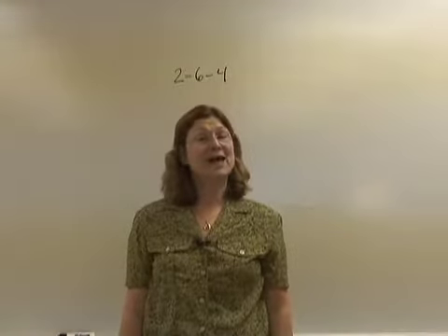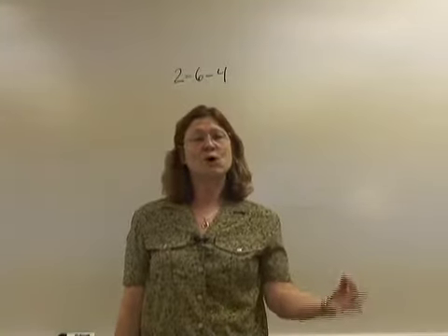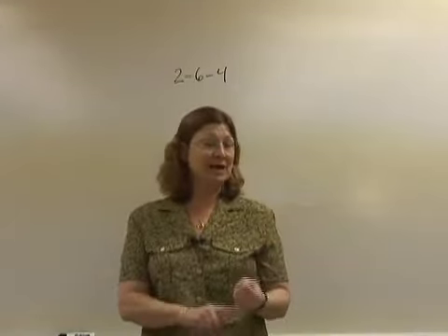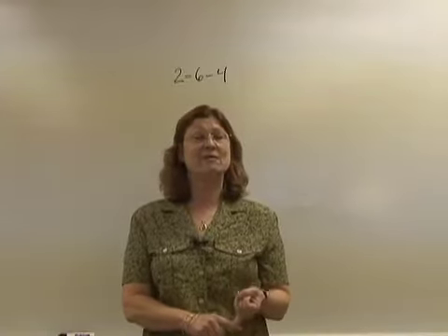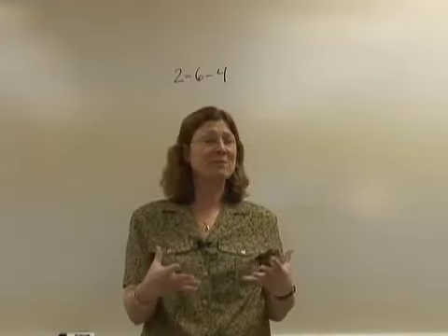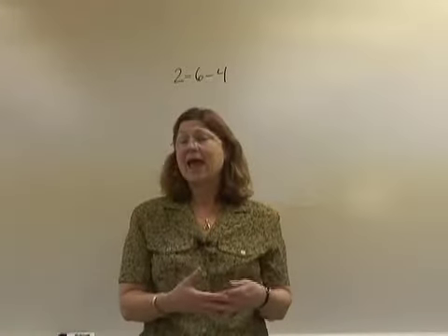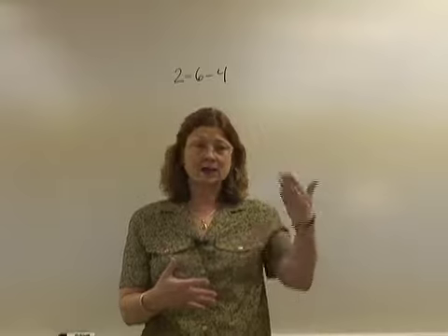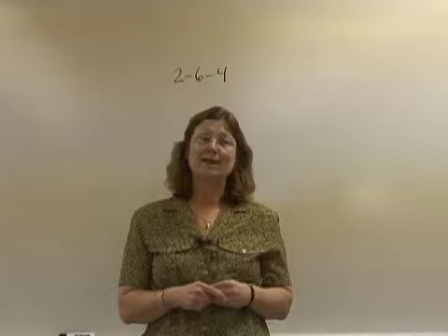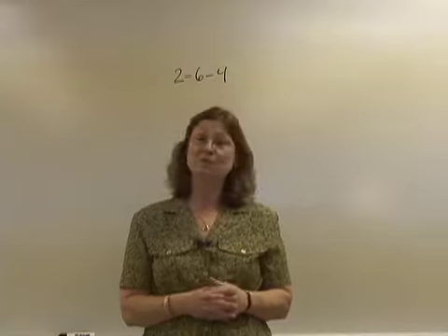These two questions are designed to help us understand what is going on in the lab. And we want to determine what is the mass of the chlorine in the product. Now we know the mass of the magnesium. We're going to put that on the scale, and then we're going to heat up the materials, and after the water has all evaporated, the product that we have is a magnesium and chlorine combination. And then, I know the mass of the magnesium, I subtract that out, and that will give me the mass of the chlorine. And from those masses, I can determine the moles and get the ratio and get the empirical formula.